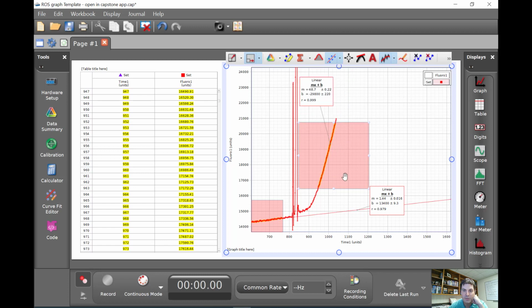Again, we're going to click on it and see that line. I think that line very much fits. What I will note is you want to ignore this part of the curve. This occurs when we open the chamber in order to add succinate in, so the light coming in gives a wonky reading.